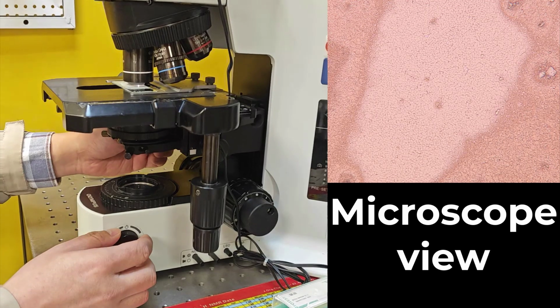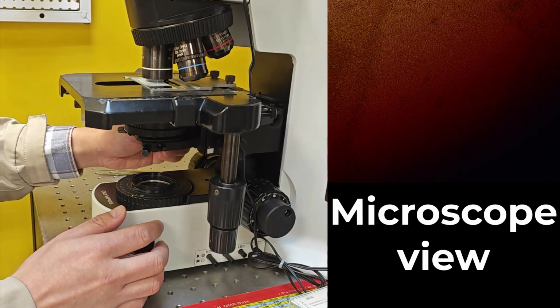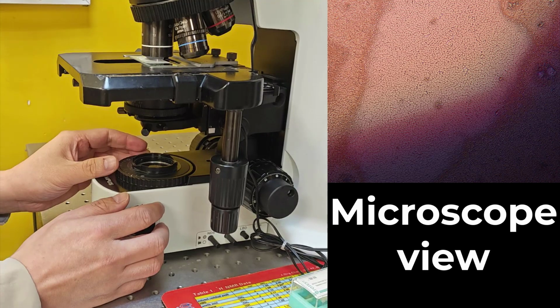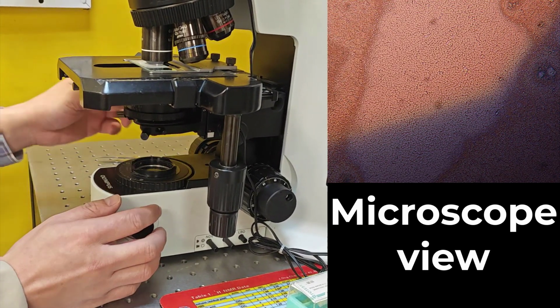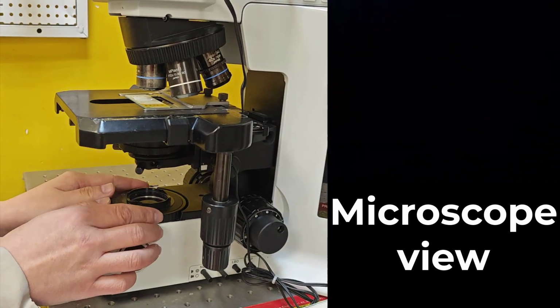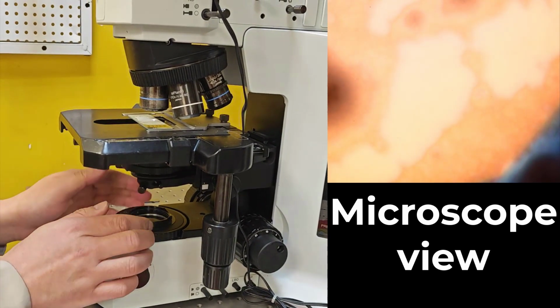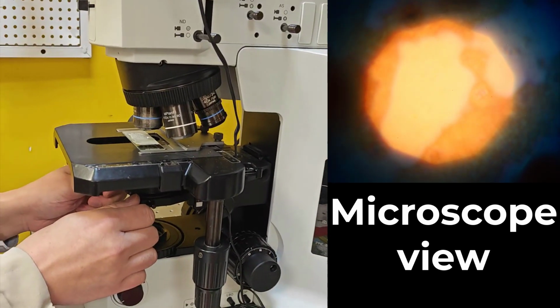However, as the condenser moves closer to the focus at a certain moment, you may see completely dark in the field. This is because your condenser is off the center. You can now switch to a lower magnification and adjust the two knobs on the condenser so you can center the focus of the illumination.